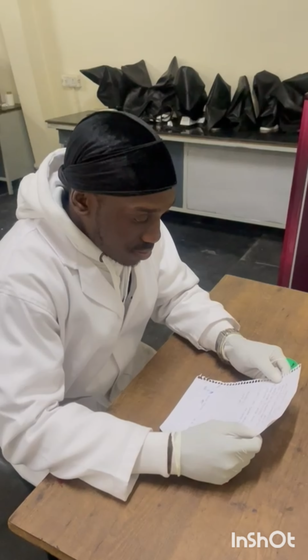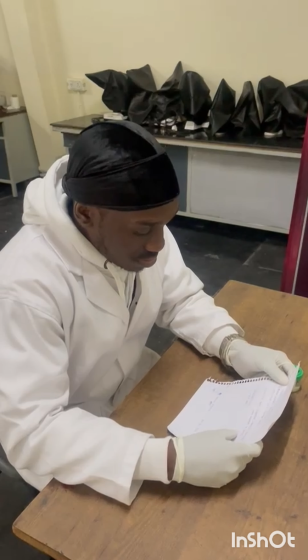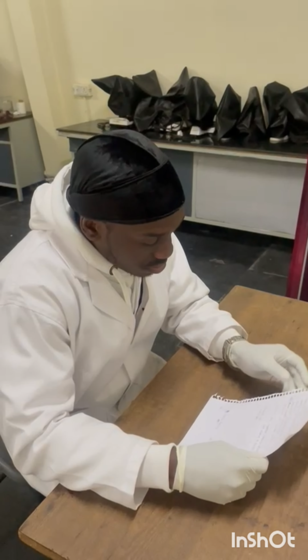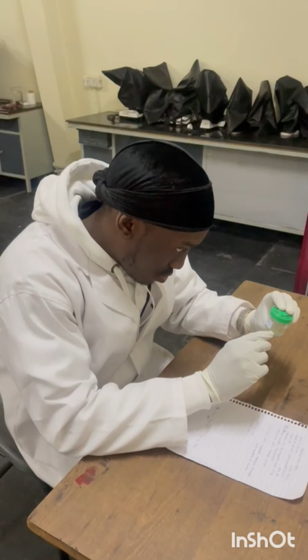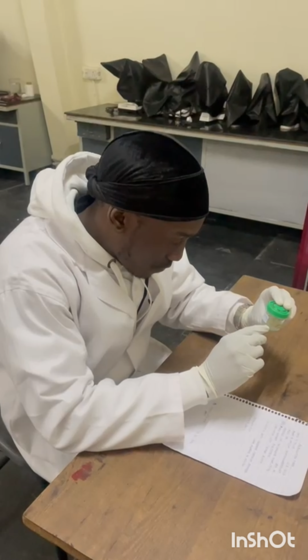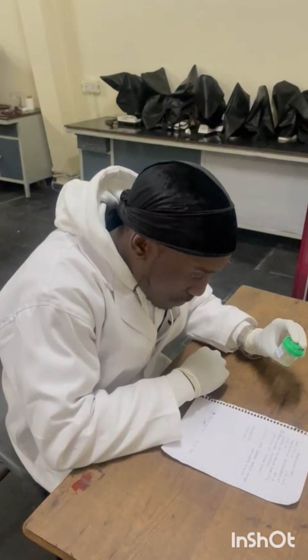4. Complete and accurate documentation. Ensures that all relevant clinical information and sample documentation are complete and accurate, facilitating accurate diagnosis and reporting. 5. Efficient laboratory workflow. Streamlines laboratory workflow by ensuring that samples are properly labeled, prioritized, and processed, reducing errors and delays.